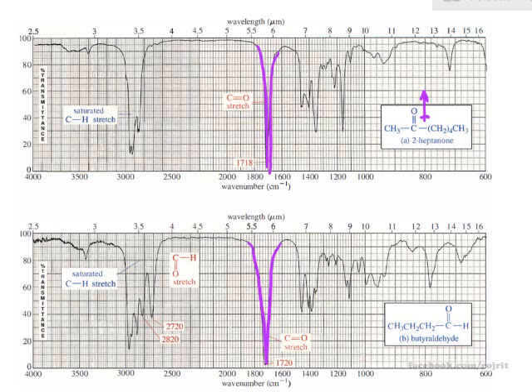If this were an alkene, you would have to see the CH of the alkene as well, right? But there is no alkene CH appearing in either structure, in either spectrum. Beyond 3000, there is nothing. If there were an actual alkene, you would see something here, but there's nothing, so this is all the carbonyl.